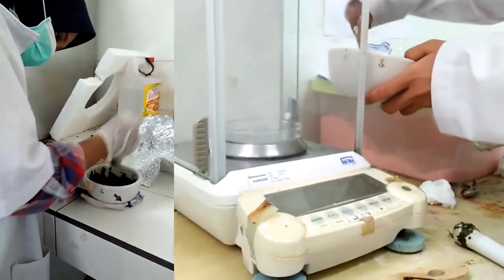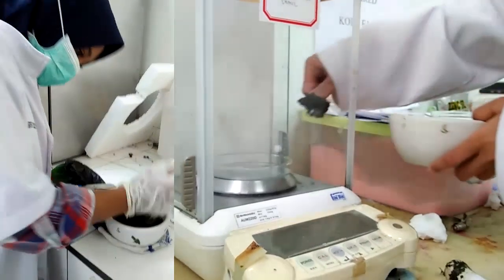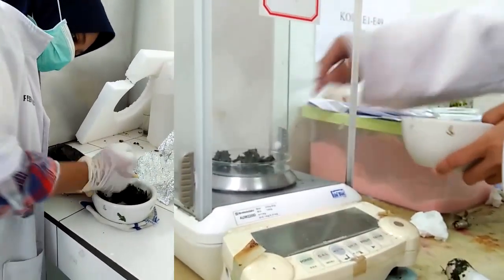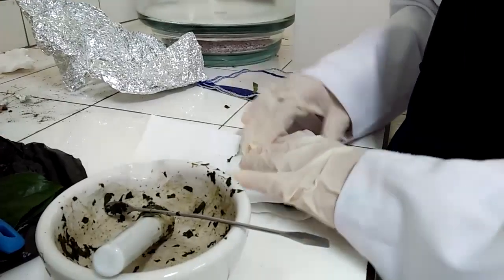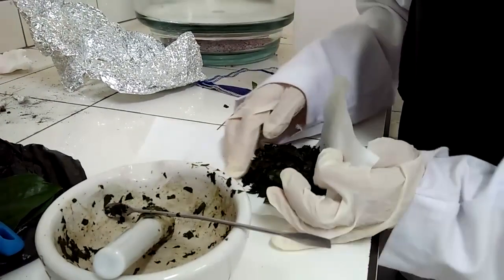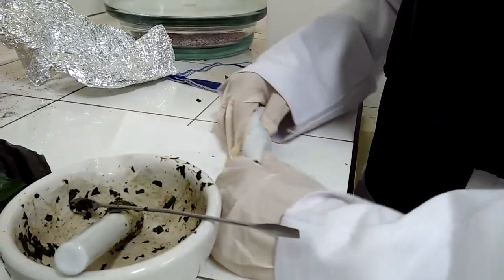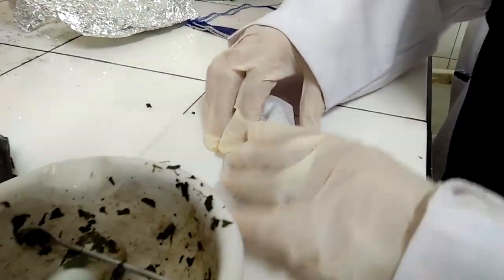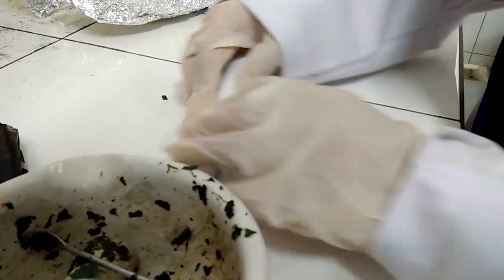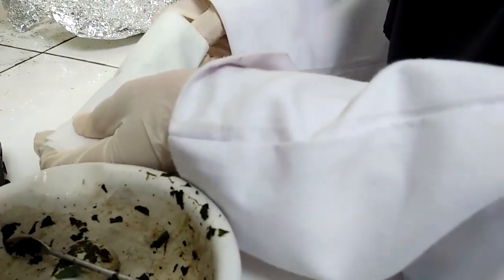Dihaluskan bahan menggunakan mortar dan alu. Kemudian ditaruh bahan di dalam cawan petri dan ditimbang dengan neraca analitik. Kemudian dibungkus bahan menggunakan kertas saring dengan membentuk seperti silinder. Tidak lupa disegel setiap ujung kertas saring agar bahan tidak keluar dari kertas saringnya.